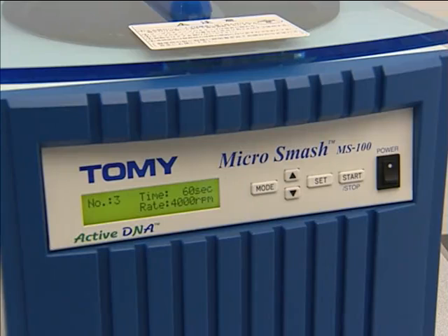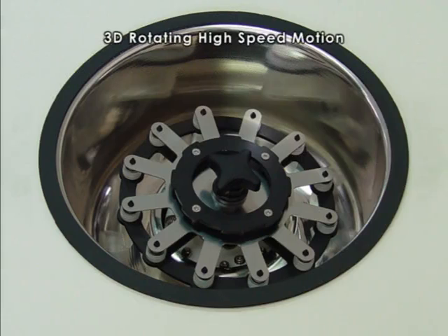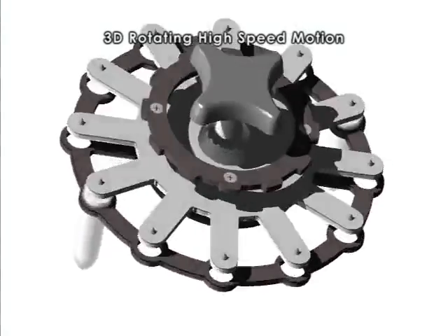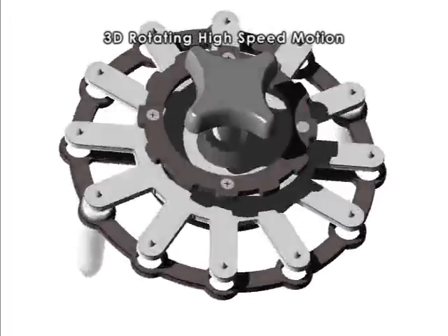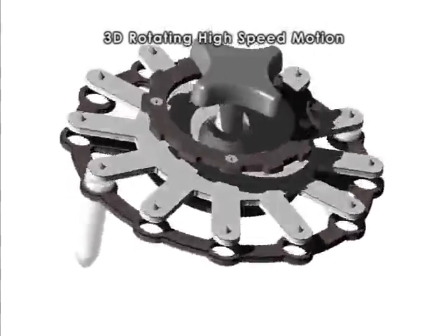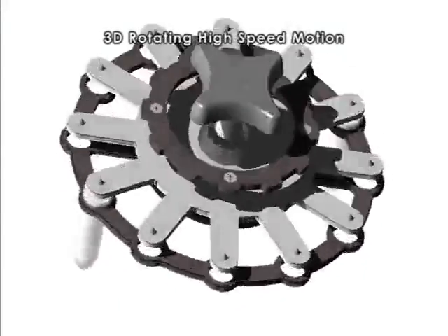The memory function can store 5 sets of operating parameters. The key unique technical feature of the MicroSmash MS100 is its 3D rotating high-speed motion for quick disruption. Using animations, I will show you how this unique 3D rotating high-speed motion actually works. You can see sample tubes move up and down and rotate in a figure-8 motion at high speed.